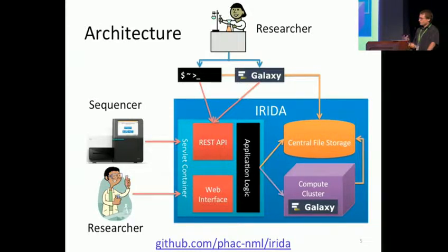And this allows people, for example, to upload sequencing data from the web interface and organize it into different projects or different folders, but also allows more automated systems like a genome sequencer to upload data in bulk without any human intervention. And one thing I'd like to highlight for anyone who's previously seen our project is that we've gotten all of our code up on GitHub now, so it's a completely free and open source project that's available for anyone else to download and install.